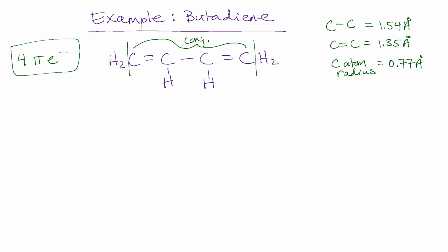If you are extra adventurous, you could make this molecule in Spartan and get some calculations going to come up with values for these. Either way, look them up, do a Spartan calculation, whatever you want to do to get some reasonable values to use. So let's add them up.